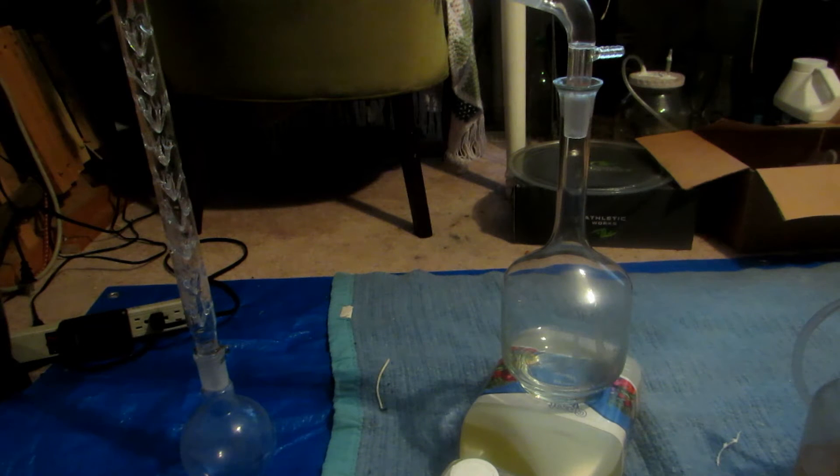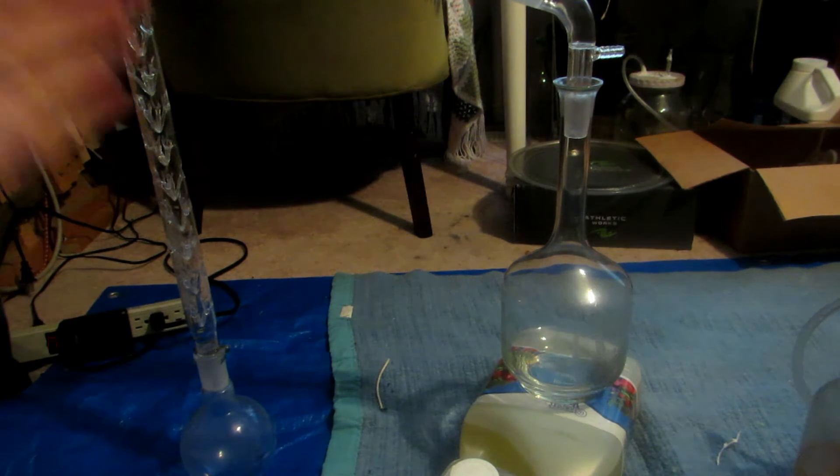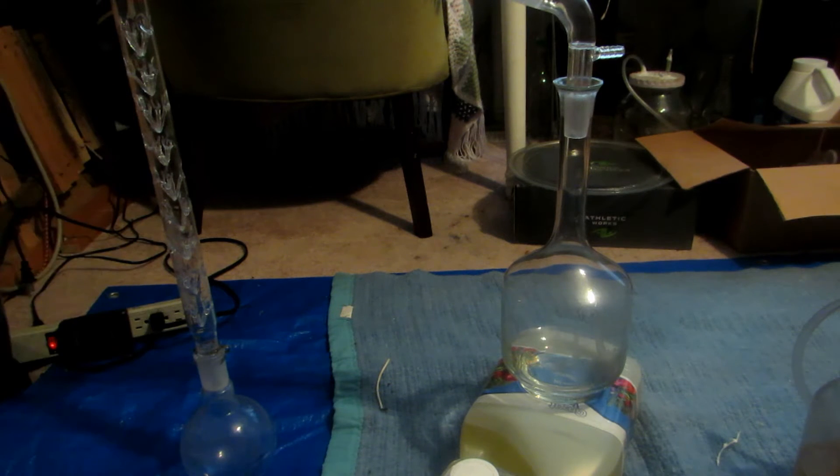It's nice and cold out, so we shouldn't need to put this in an ice bath to keep the dichloromethane from boiling off, because it is such a volatile compound. But if you were somewhere like Mexico where it's 25°C or higher, I would definitely recommend using an ice bath on your receiving flask, otherwise you're going to start losing good amounts of dichloromethane.